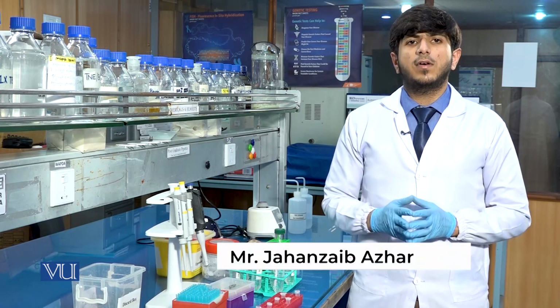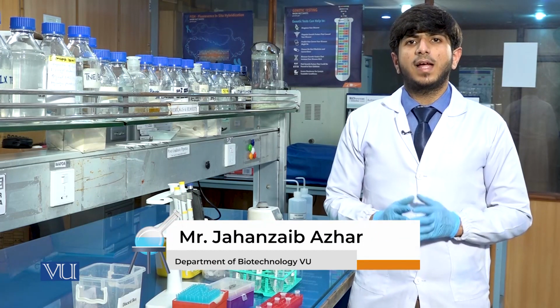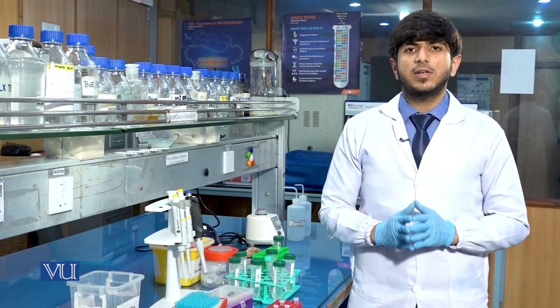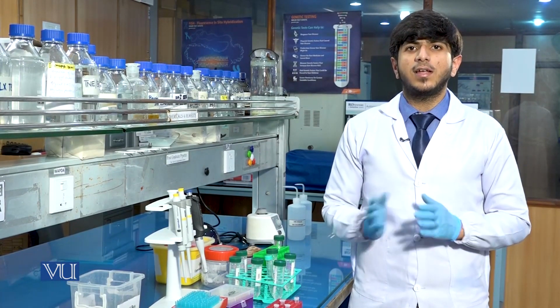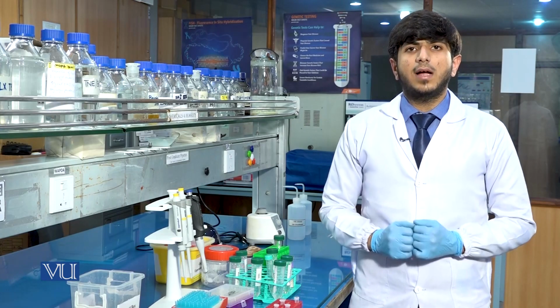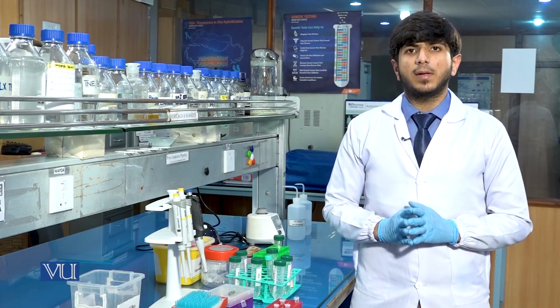After the transfer of the upper aqueous phase to the new tube, we will then add the isopropanol to precipitate the DNA. The basic function of the isopropanol is to precipitate the nucleic acid. So here in this case, when we are extracting the DNA, the isopropanol will precipitate the DNA. Now we will add an equal amount of isopropanol to the sample.